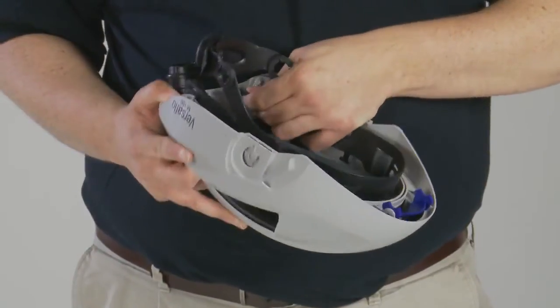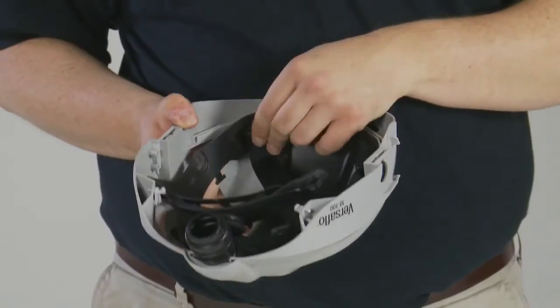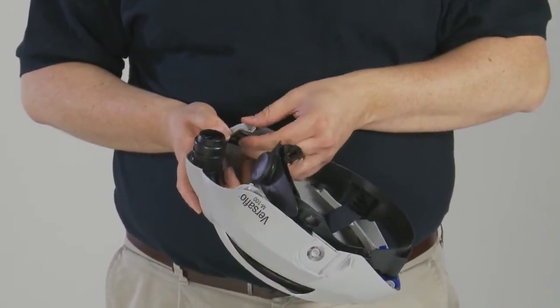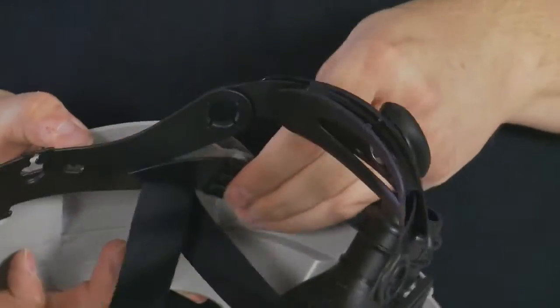To remove the head suspension from the M100 series, pull the height adjustment slots free from the pegs at all four points. This can also be done to remove the headband from the M300 or M400 series. The headband can be replaced by pushing the height adjustment slots in the headband back over the pegs at all four attachment points.